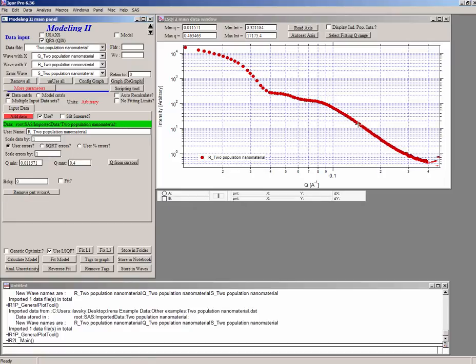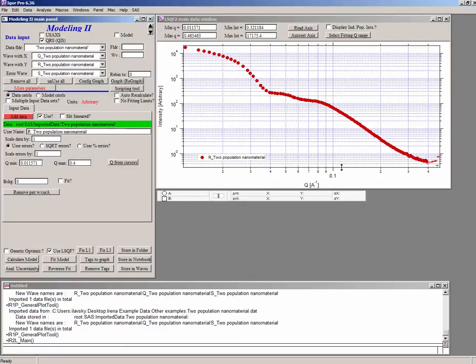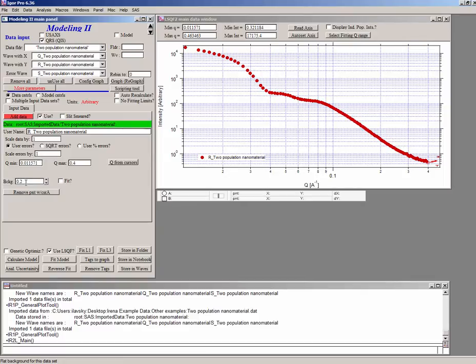The other thing is we can kind of look at that and see, well, if this was a small angle scattering properly subtracted, only small angle scattering, the data would be basically coming down as some kind of Porod slope, Q to minus 4 or similar to it. And these data tend to flatten out. They tend to flatten out and so that means there's some flat background which was not subtracted. And if you look on this here, that's 1.987654. So probably the background in this is somewhere like 0.2 or 0.3. So that's an amount of flat background.